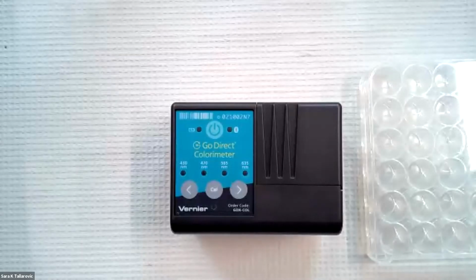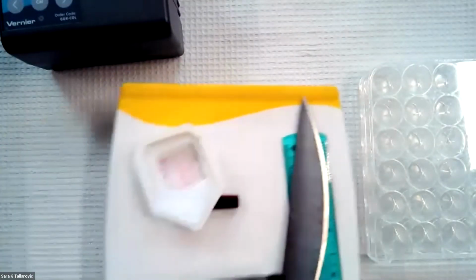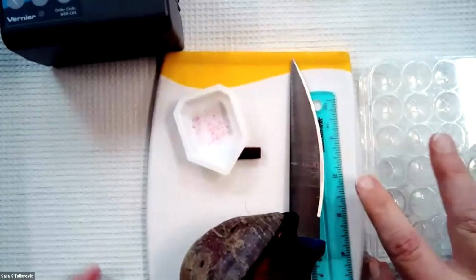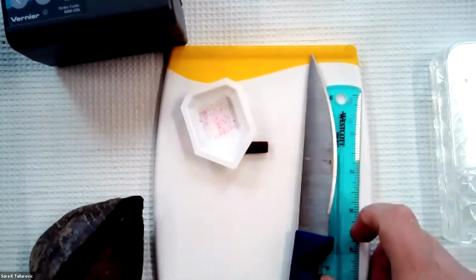All right, so without further ado, I'm going to actually show you how this lab works. I mentioned that we're going to use beet, and I've got my colorimeter here in view. Let me switch out. I'm going to show you very briefly what it looks like when you're cutting these beet samples.